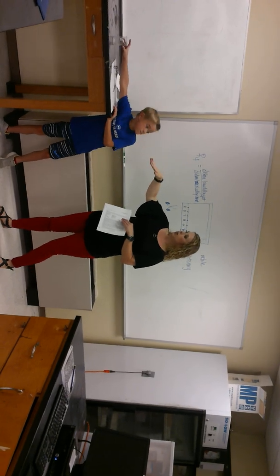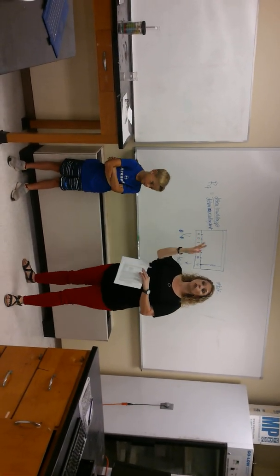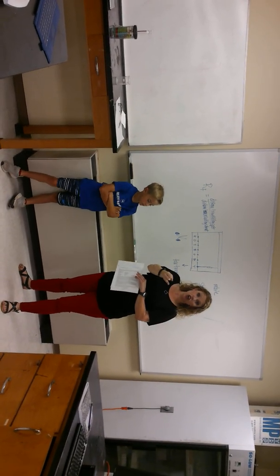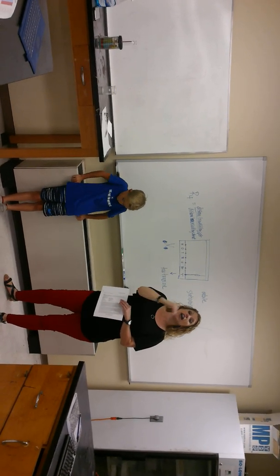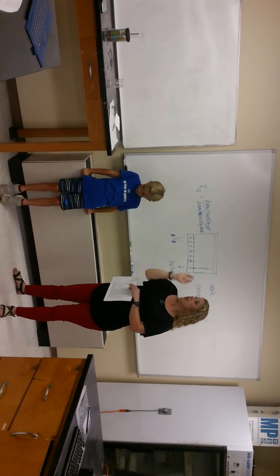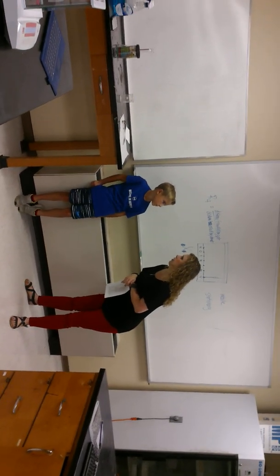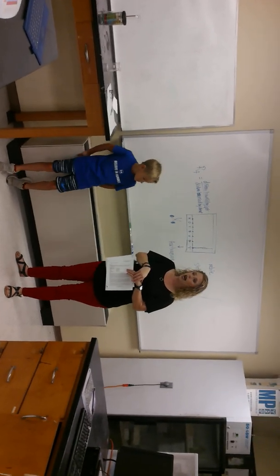Oh no, we're not going to use the waste beaker there. What you're going to do is you're going to have a second set of test tubes. You want to pour that solution that has the dye and the sugar from the candy coating and maybe a little bit of chocolate into a second set of test tubes. The M&M, please, for goodness, what do we not want to do with that M&M that's in that test tube? Eat it, because it's been in acetic acid. So just toss it into the trash, okay?